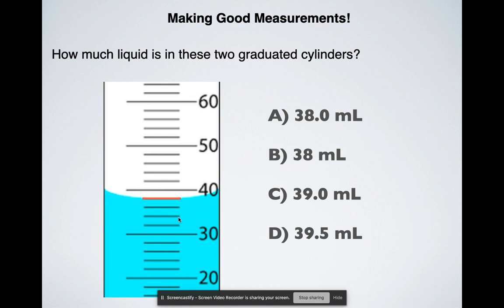So I have 30 and I have 40 and then I have these little lines here. What do these lines represent then? 32, 34, 36, 38, and then 40.